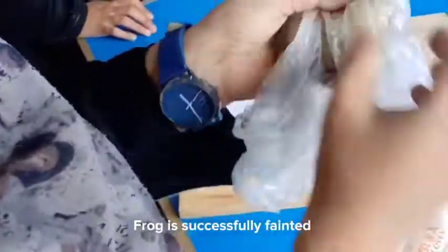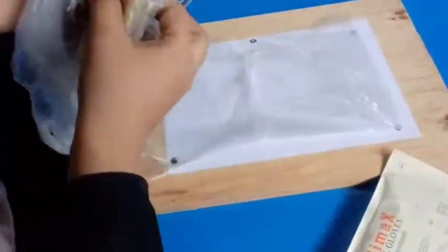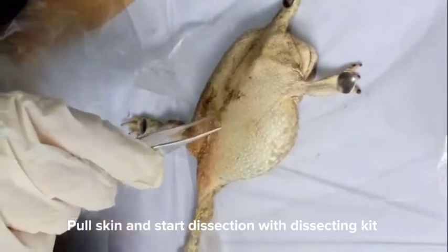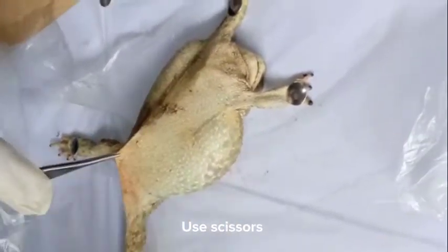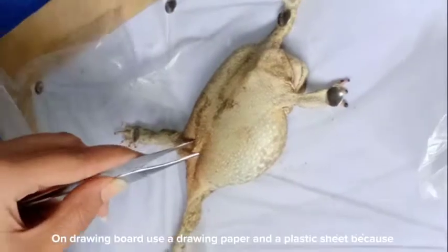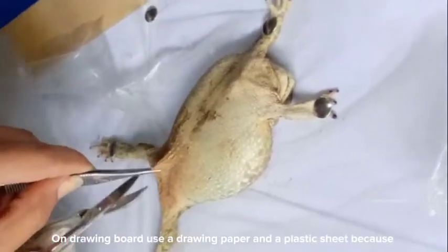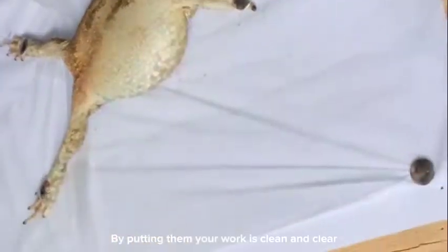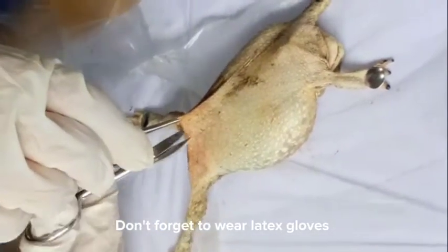Frog is successfully fainted. Pull skin and start dissection with dissecting kit. Use scissors. On the drawing board, use a drawing paper and a plastic sheet because by putting them, your work is clean and clear. Don't forget to wear latex gloves.